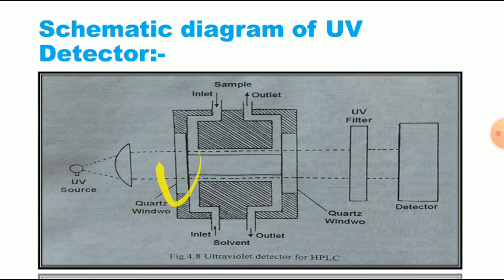These are the quartz windows. This one will be the quartz window entrance and exit also. This is the quartz window. Here is the UV filter that will filter out the UV light.